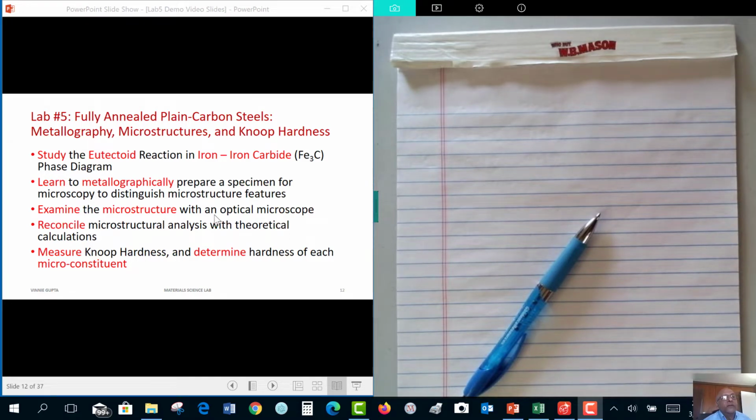Okay, folks. So in the first part, you learned about the eutectoid reactions and the resulting microstructures. In fact, you also calculated amounts of different microconstituents, and I hope you enjoyed it. It may be covered in 304, 305, maybe next week.